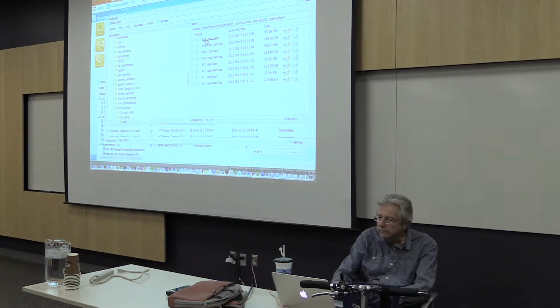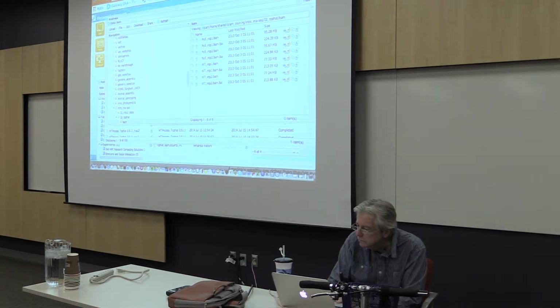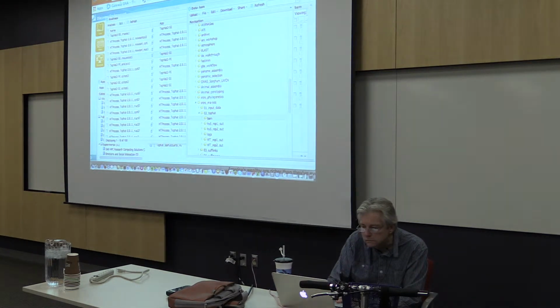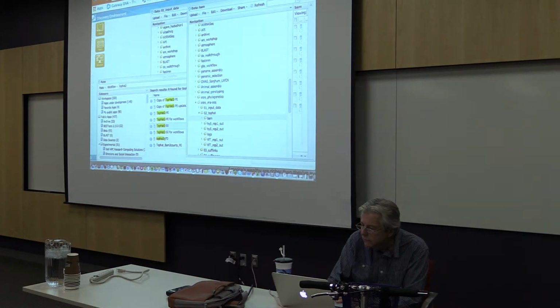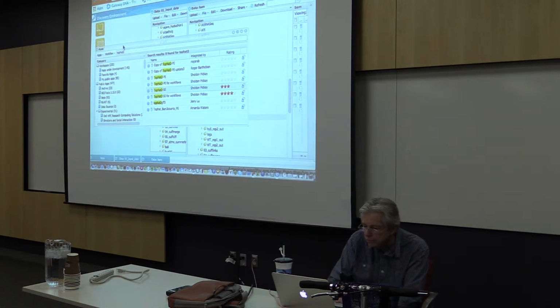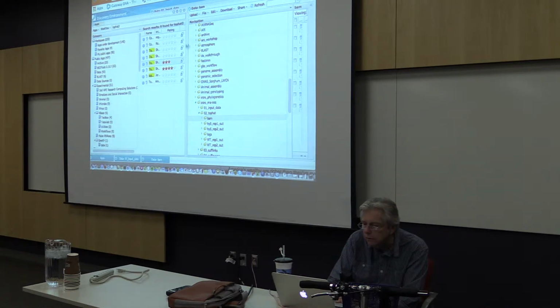And let's do that while we're here. So let's snap that to the right. Let's get the analyses window out of the way. It's a little harder on a laptop with a small screen, but it's really handy having that ability to arrange the windows.